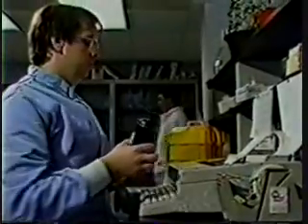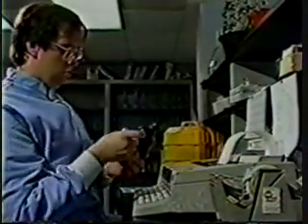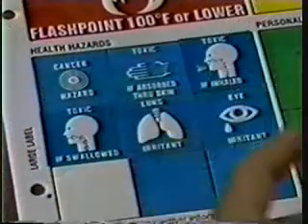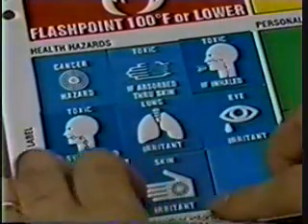Anytime you transfer a chemical to another container, you must label that container as well, so everyone will know what's inside. Your facility probably has a standardized labeling system for these secondary containers.